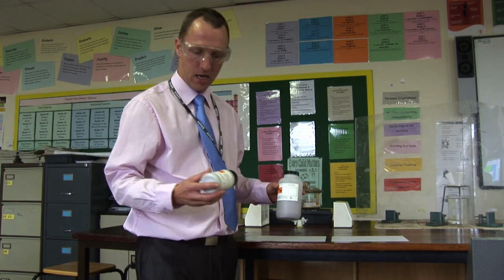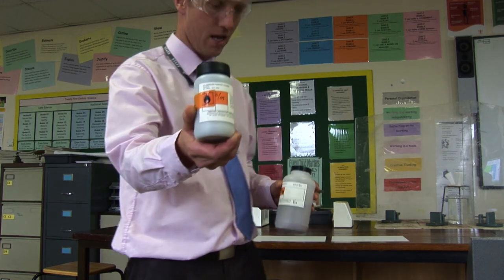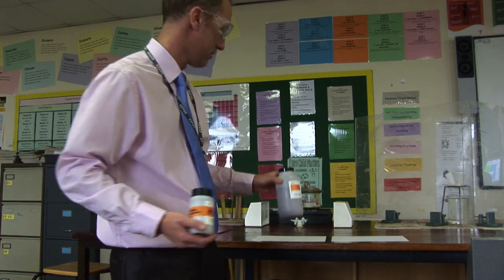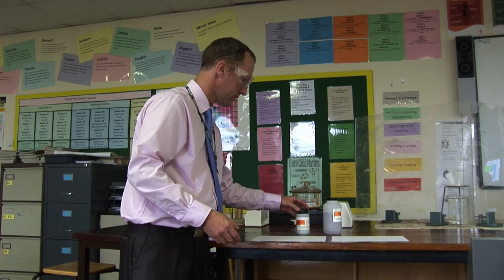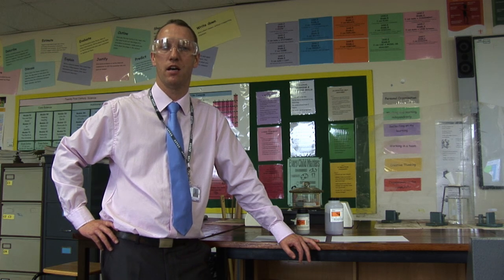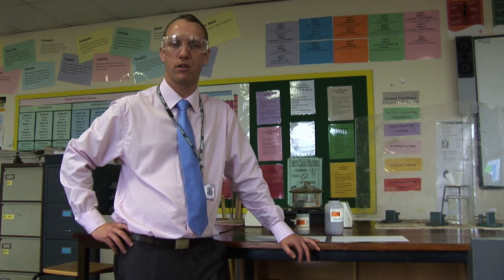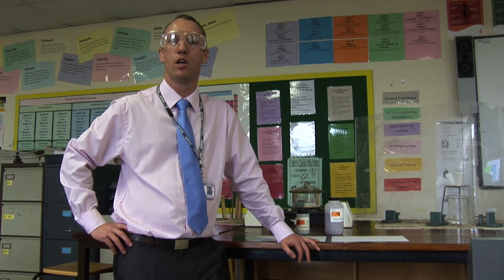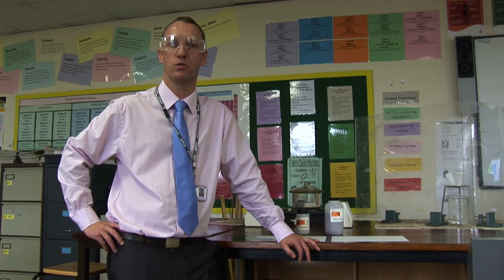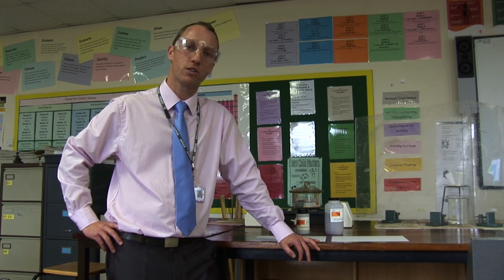We've got aluminium powder and iron 3 oxide. It's a displacement reaction because aluminium is higher up the reactivity table than iron. So when you mix the aluminium powder with the iron oxide, the aluminium will want to rip oxygen off the iron oxide molecules to form aluminium oxide, leaving what would initially be molten iron.